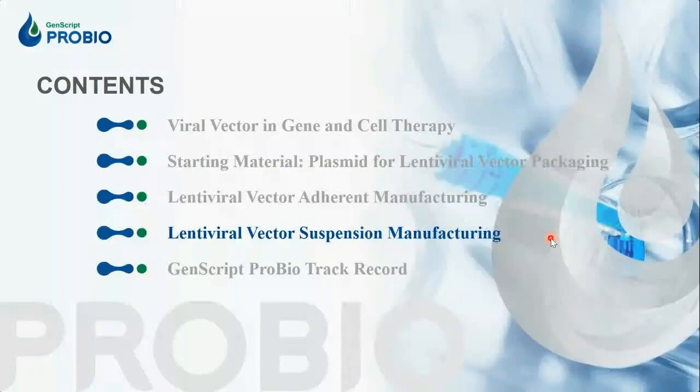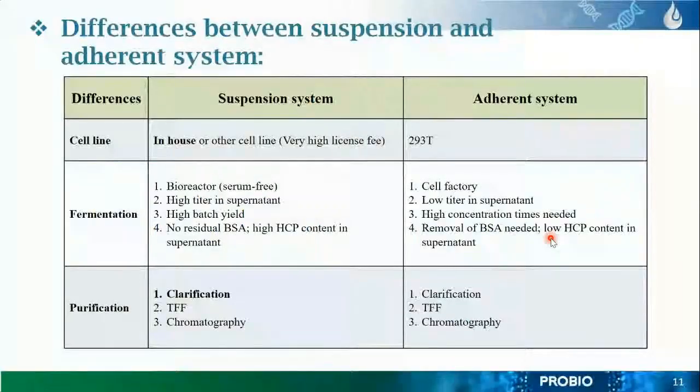Now coming to the suspension part, a lot of people have questions about the basic differences between the suspension system and the adherent system. We get a lot of questions, and we always try to answer, but here I have classified them into 2 different groups.